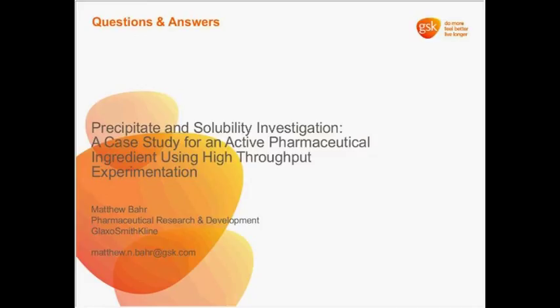Just one more question here for you. On the 18th slide, your data begins at 1 hour. Have you tried to shorten this to 15 or 30 minutes at all? This question actually relates pretty well to one of the previous questions. When I mentioned n equals 4 or n equals 8, that's the number of replicates that I'm running for each of those experiments.